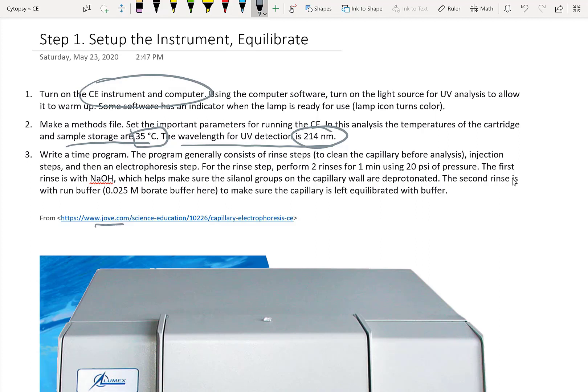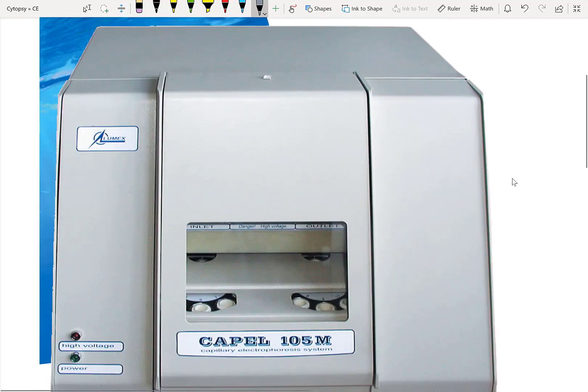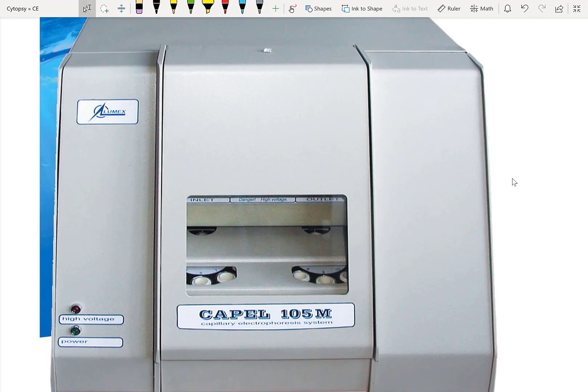Finally, the third step is to write a program which consists of rinse steps. And inside the rinse steps, we're going to be doing an NaOH rinse as well as a run buffer rinse, which is borate buffer. Let's take a look at what this actually means. So here's our instrument. We're going to first turn it on. Okay, there should be some power here. Let's just color that in. Okay, the power is on.